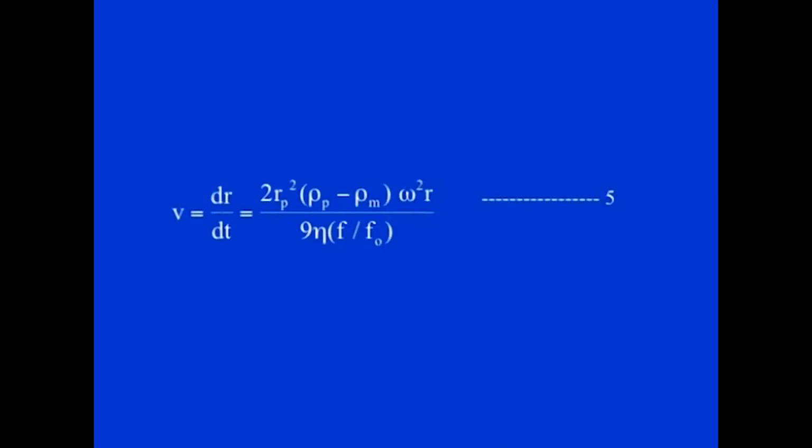Now, particles of similar density but only slightly different size can have large differences in their sedimentation rate. Also, the sedimentation rate will decrease when the viscosity of the medium increases. If you recall, the velocity or rate of sedimentation is inversely proportional to the viscosity of the medium. These factors play an important role, and apart from that, as we have seen, the applied centrifugal field, the square of the angular velocity omega and the radial distance r, will also play a role in determining the sedimentation rate.